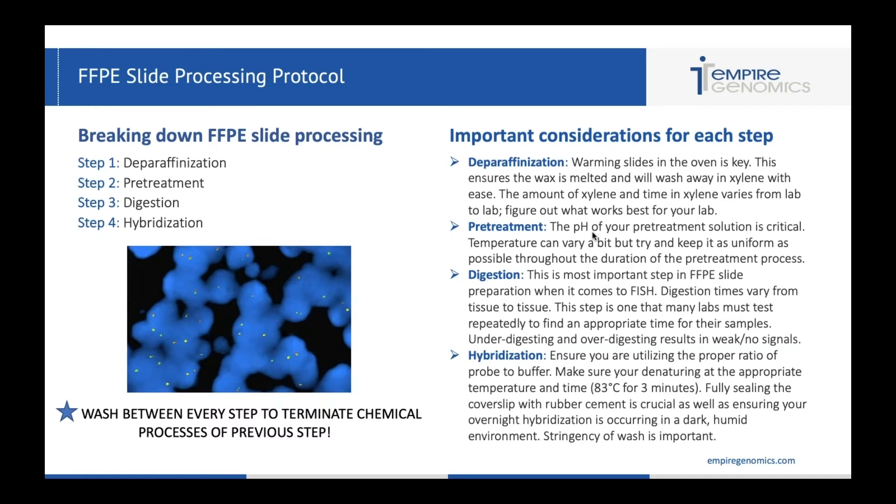With deparaphanization, warming your slides in the oven is key. This is really going to ensure that the wax melts and washes away in xylene. I have seen labs that don't warm their slides and they don't have an adequate deparaphanization — that's going to cause issues with signal and digesting your tissue. You want to be sure to warm your slides at an adequate enough temperature. You can usually see when the wax begins to melt and figure out a proper time for your oven in your lab.